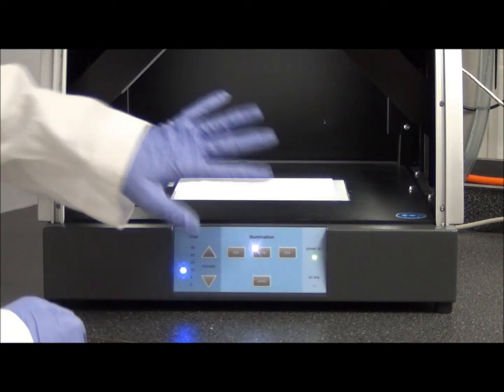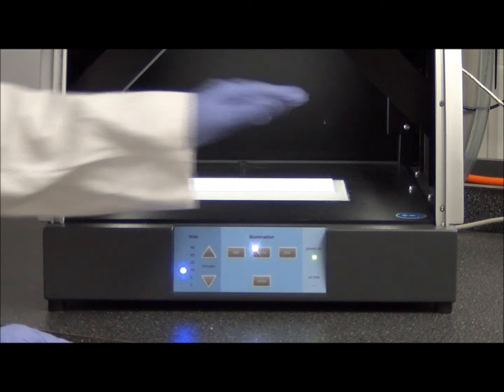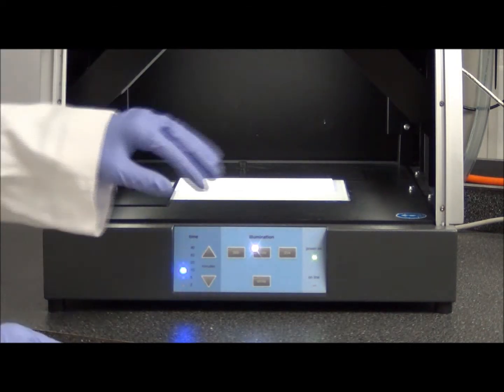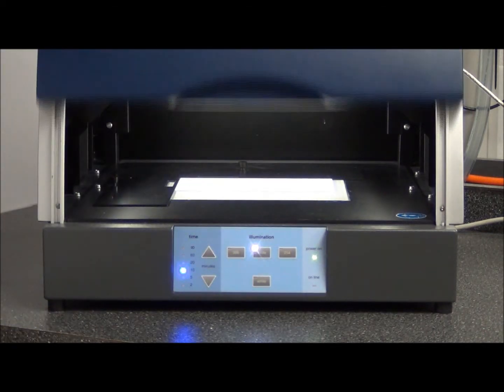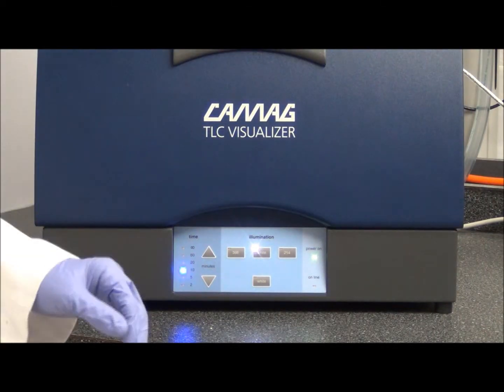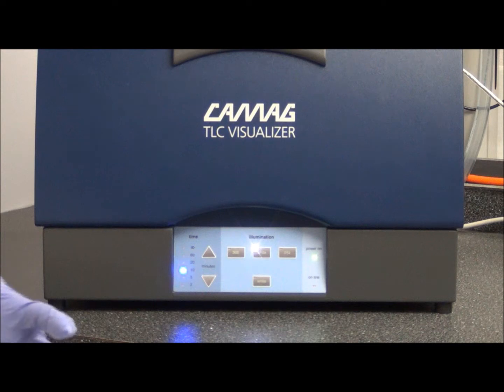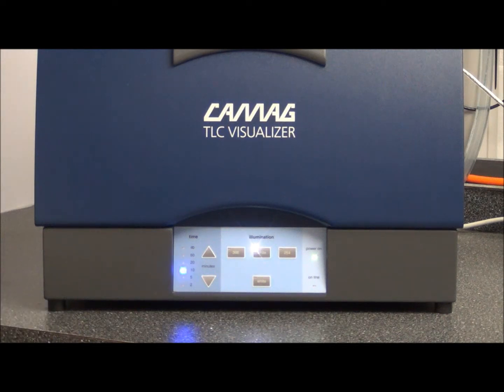You can just basically put the plate inside and shut the door. And now we will move to the software where we will acquire the appropriate images.